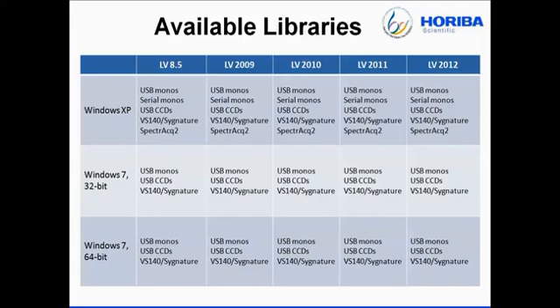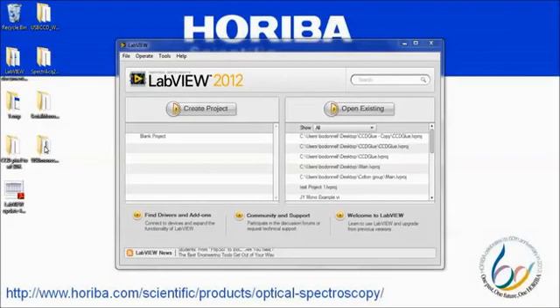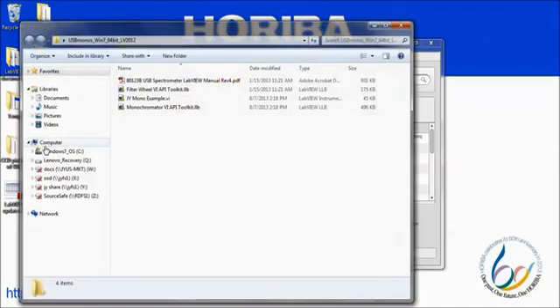I will briefly summarize each category individually and show a few demo programs as well. I am going to begin with spectrometers controlled through USB. This would include the IHR 320 and IHR 550, as well as the M-Series 2 spectrometers. If we look in the containing folder, we see a variety of files. First is the manual in PDF form, which is a great place to start to familiarize yourself with the VIs included in the various libraries.